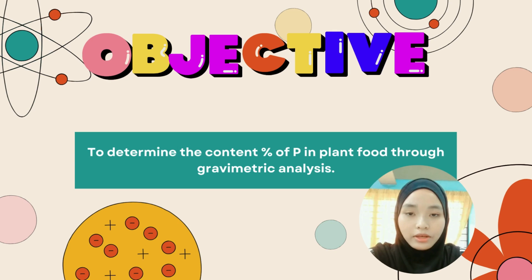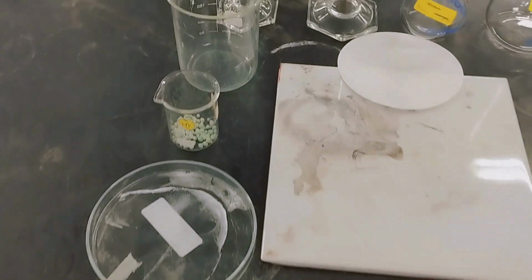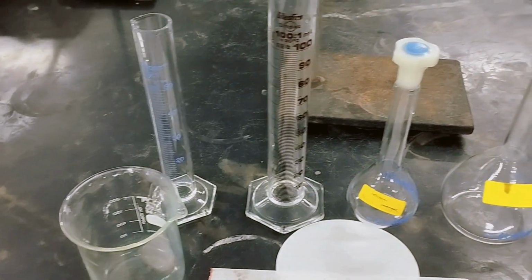Okay, our objective for this experiment is to determine the percentage of phosphorus in a plant food through the technique of gravimetric analysis. Now let's look at the method. First, we have to prepare all the apparatus.